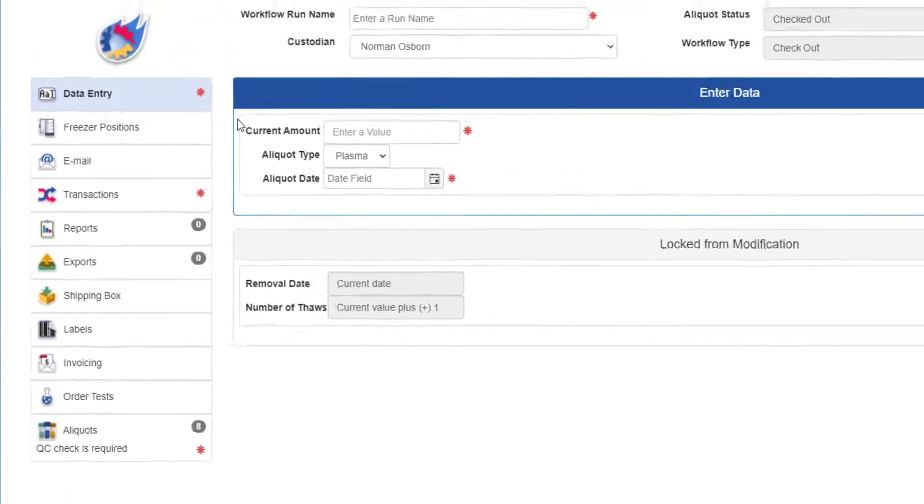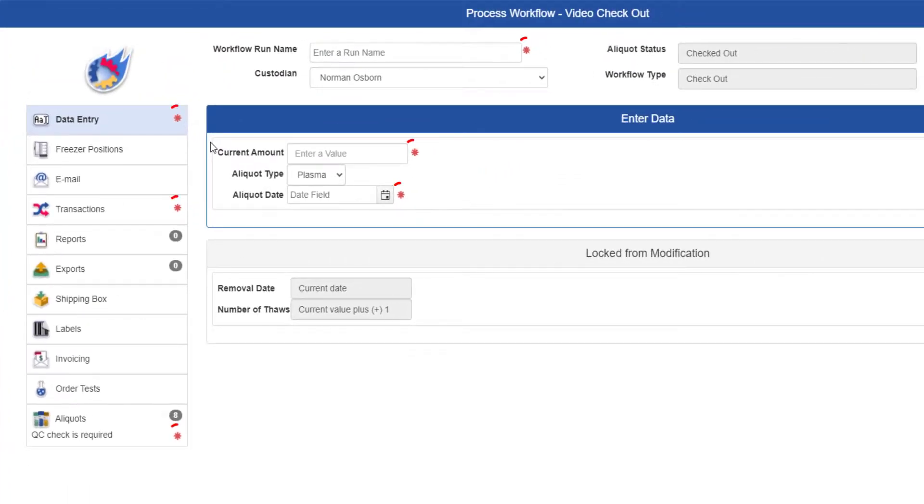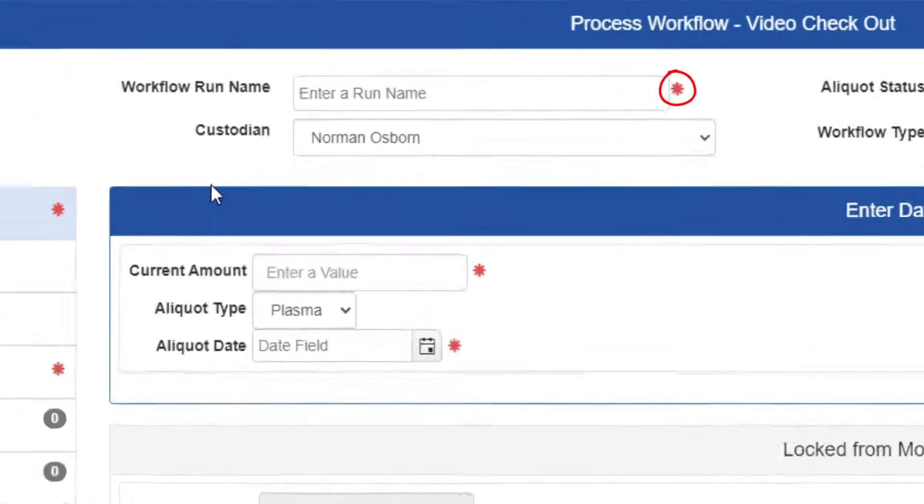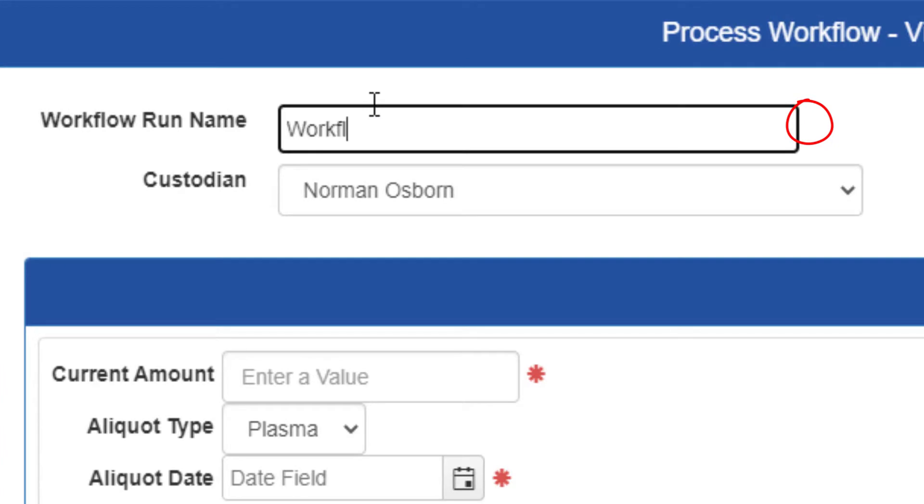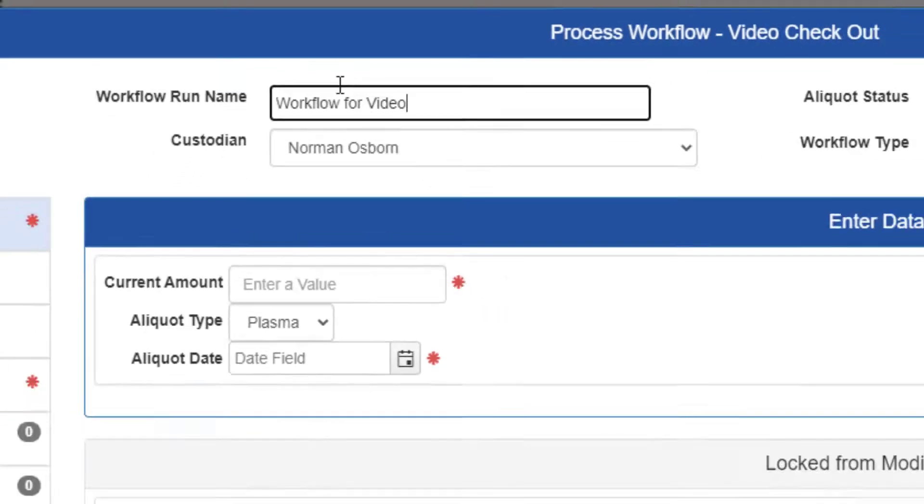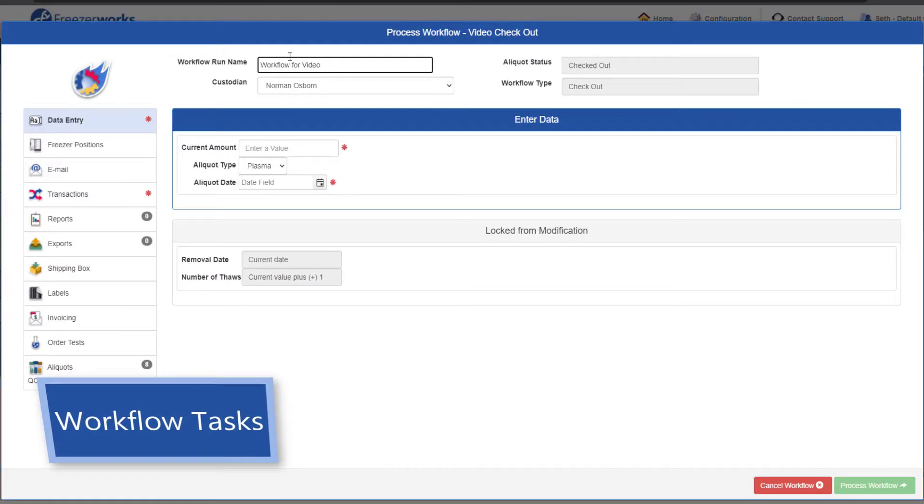Finally, take note of all the asterisks on the form. These are the tasks and fields required to process the workflow, such as the workflow run name. Filling in a required field removes the asterisk. Okay, onto the workflow tasks.